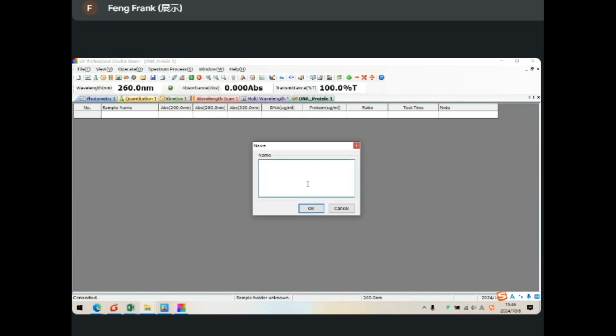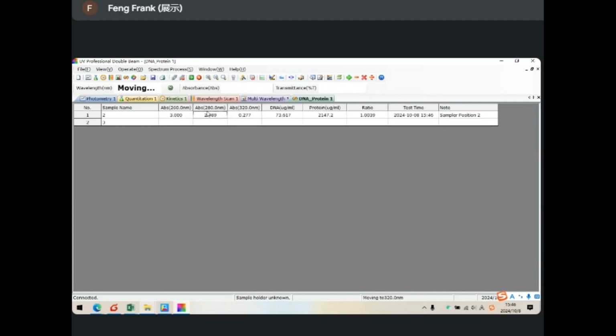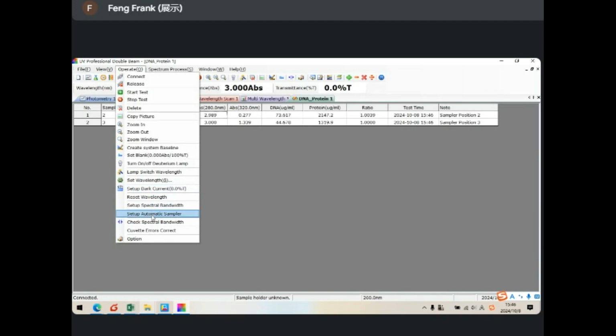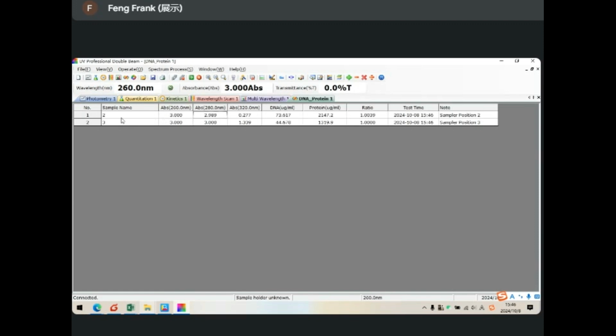And about the wavelength scan function, you can do some calculations on the curves, like add, minus, times, and divide. Also, you can do the derivative for the scanning curves. These functions I mentioned are the most often used. That's it, my friend.